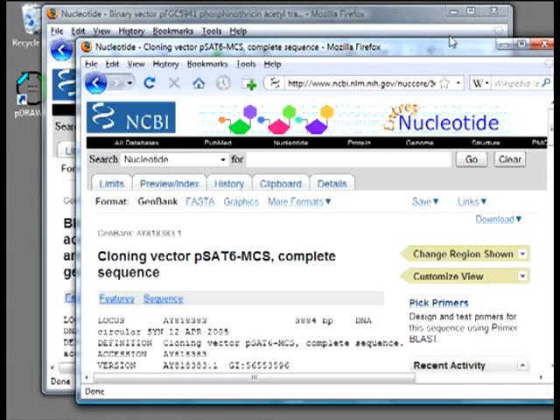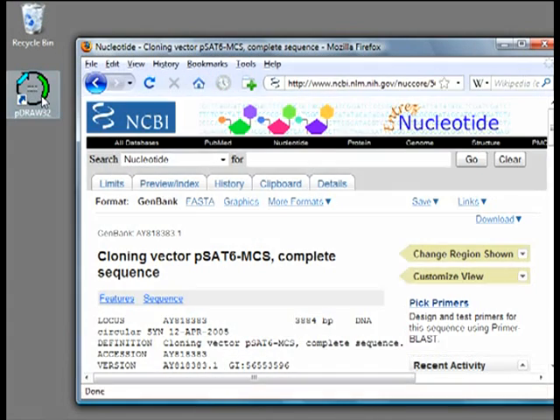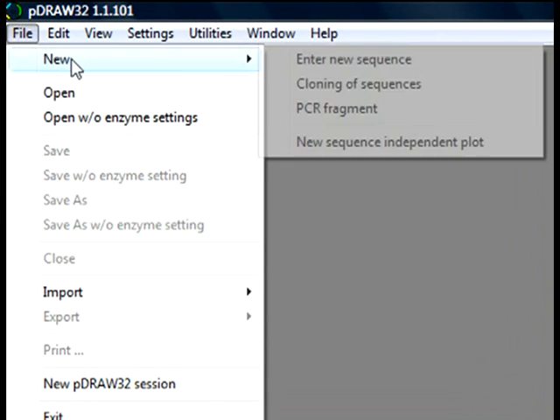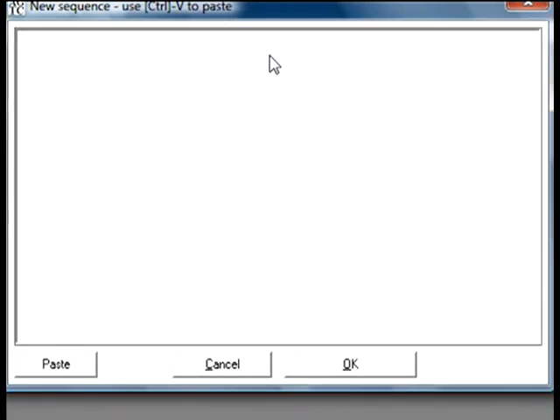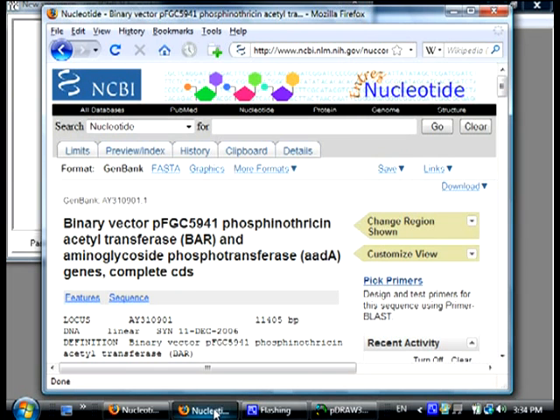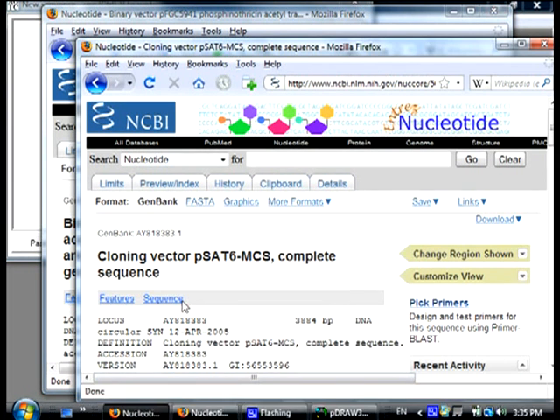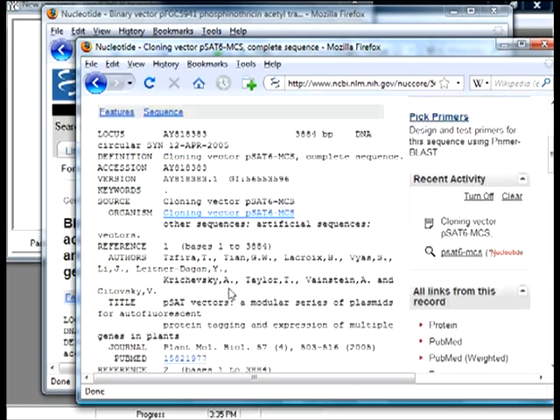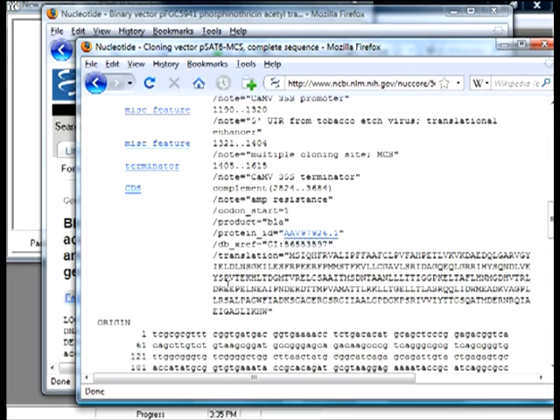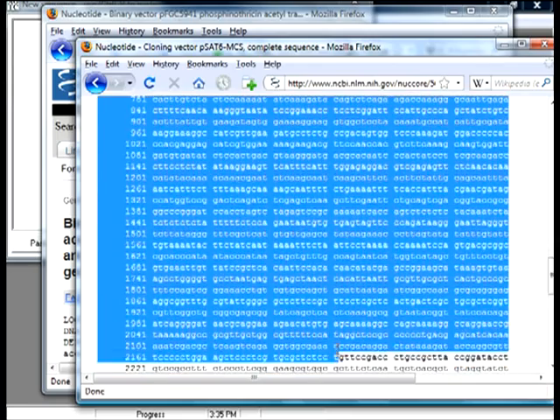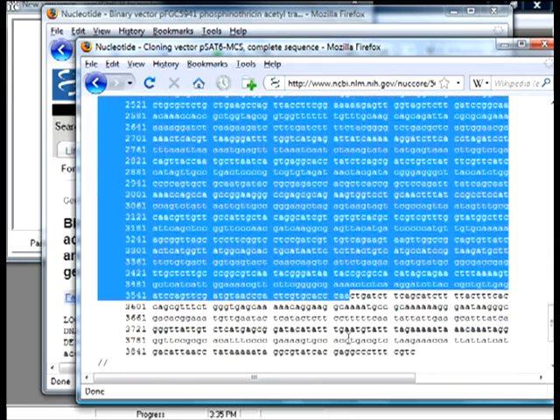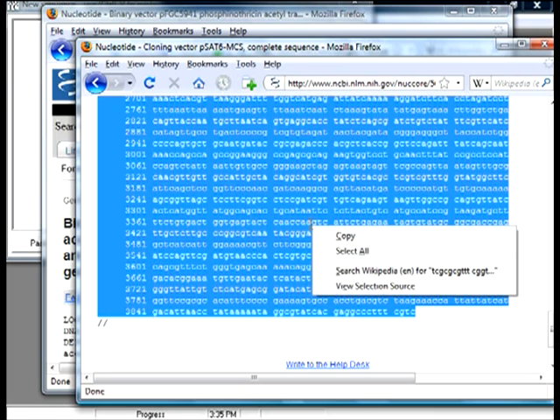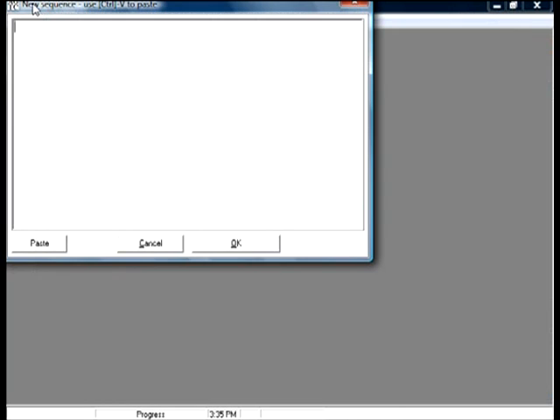Then I launch P-Draw32, go to File, New, and to New Sequence, and insert here the sequence of PSAT6MCS. For that I go back to the web browser, scroll down, select the sequence, copy it, go back to P-Draw32, and paste it.